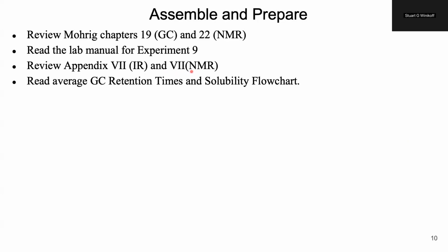Then make sure to read the files on Canvas for GC retention times and our solubility flowchart, and try and include this information in your lab manual. It will make determining your results much easier. Hey, congratulations, you're already watching this video.